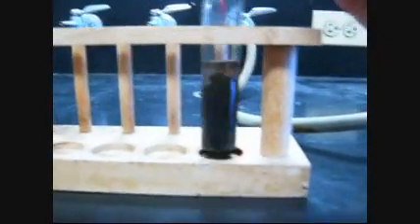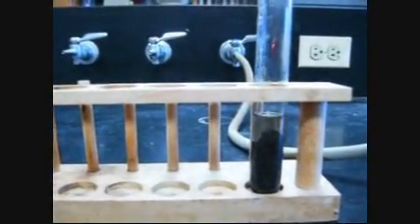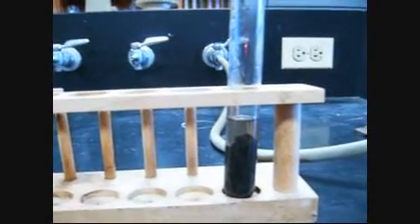Alright, and you can see the black particulate solid is settling down to the bottom here. Let's see if we can get a better look at this. So there's a black solid, a dark brown solid. Okay, now for the third reaction, we're going to add 10 milliliters of diluted hydrochloric acid. This is 1.5 molar. The sodium hydroxide was also 1.5 molar, and we're going to add this hydrochloric acid solution to the test tube.